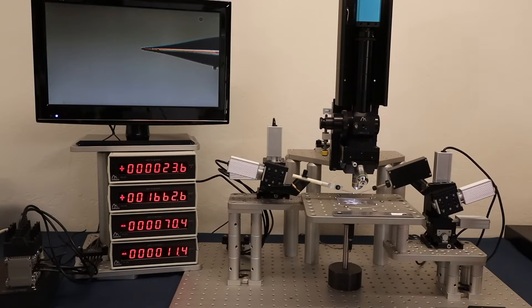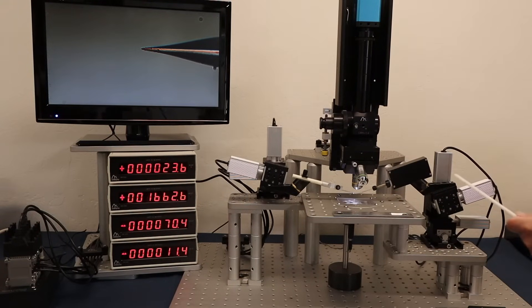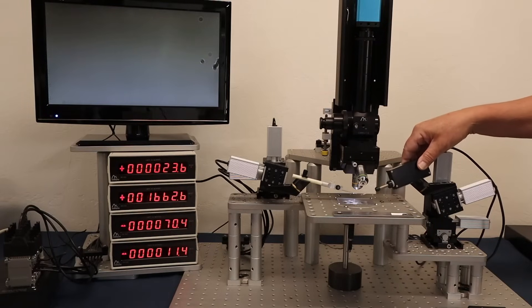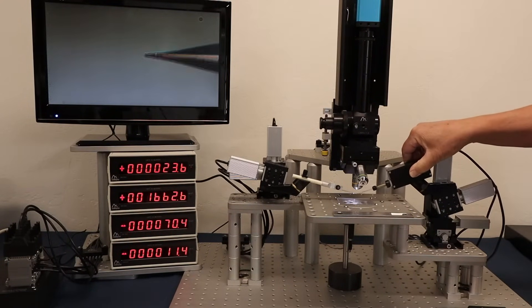This product is shipped with a rod type holder but can be converted to hold electrophysiology head stages using the MXC45D. This repeatable probe clamp holder can swing out of the test area to change the pipettes and then swing right back in.